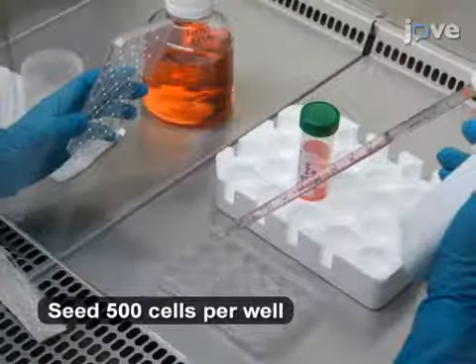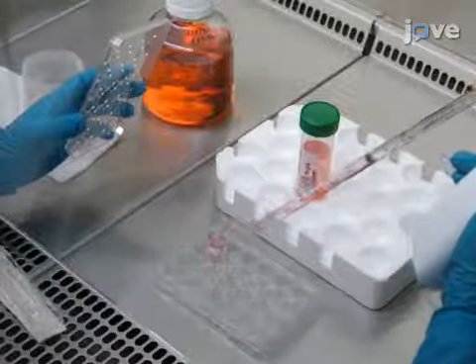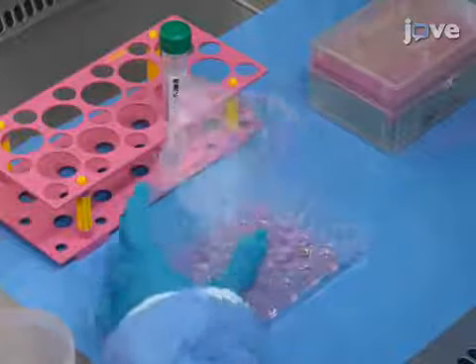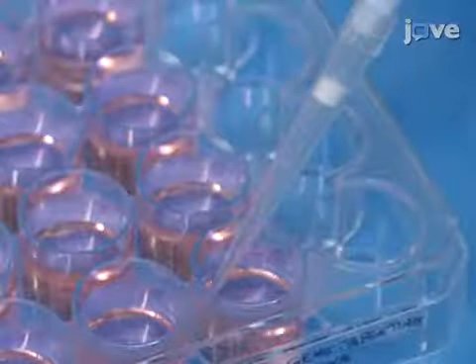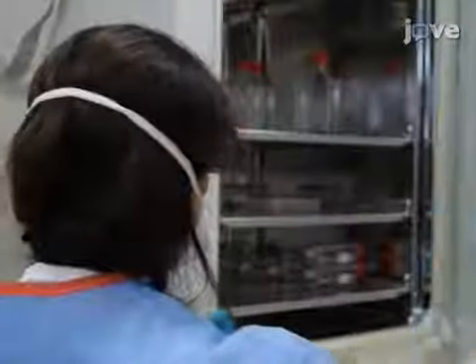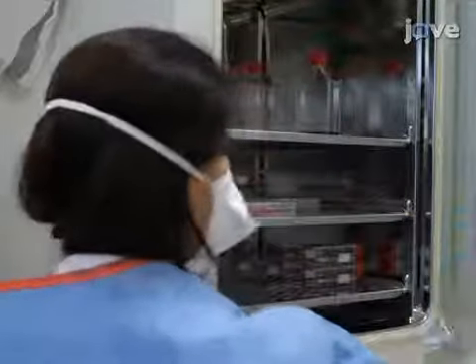Next, seed cells into 24 multi-well culture plates. Expose the cells to increasing concentrations of target therapy inhibitor from 100 micrograms per milliliter to 400 micrograms per milliliter. For the efficacy of gene knockdown, certain oligonucleotides must be specific for reducing target expression. Design tools and a mixture of siRNAs for the same target gene are useful for this purpose. Incubate in a CO2 incubator at 37 degrees Celsius for 15 days.